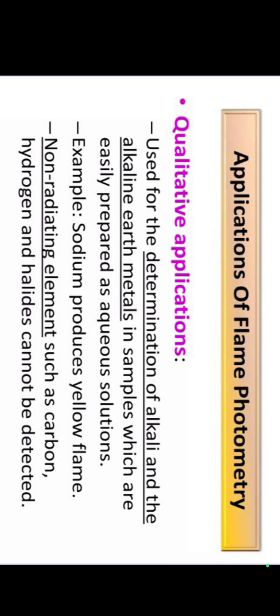Second one, quantitative application. It helps to determine the suitability of the soil for cultivation. What soil we use for wheat cultivation will be determined by using flame photometry.